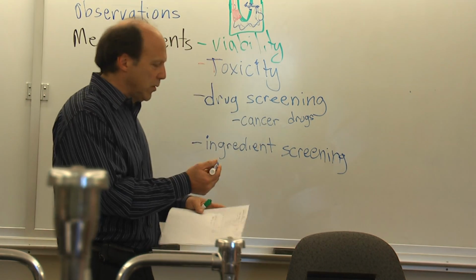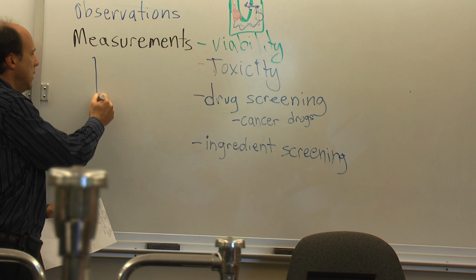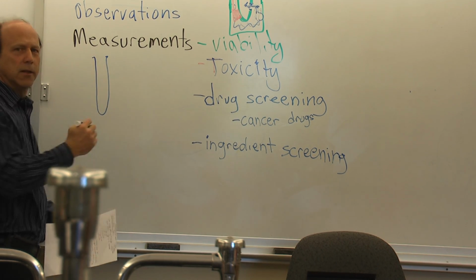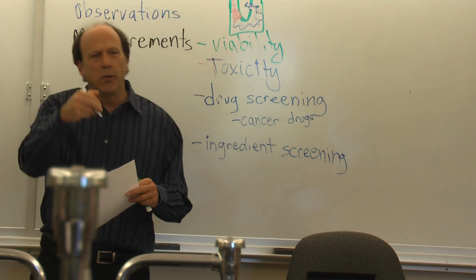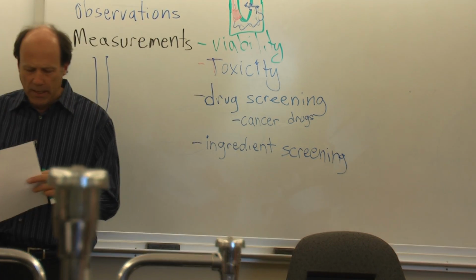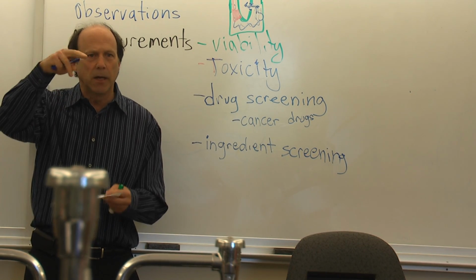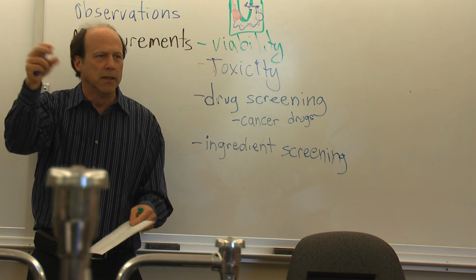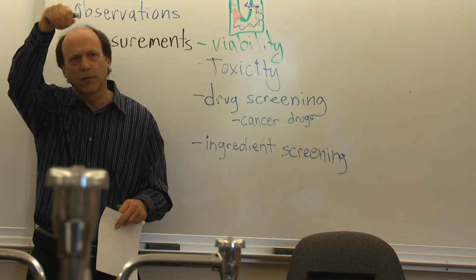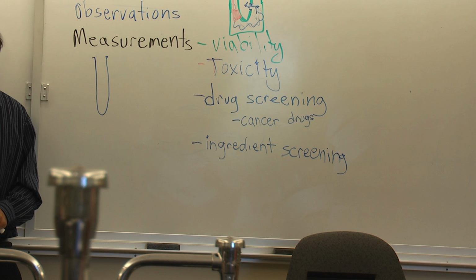So the old thing used to be test tubes. You guys work with test tubes, maybe in chemistry? The glass test tubes, and you're doing a reaction and you're holding the test tube and heating it or whatever you're doing. Well, that's nice, but it's kind of cumbersome. You've got a couple of mils of solution and you're adding some stuff to it and swirling this test tube around. That's kind of inefficient, right?